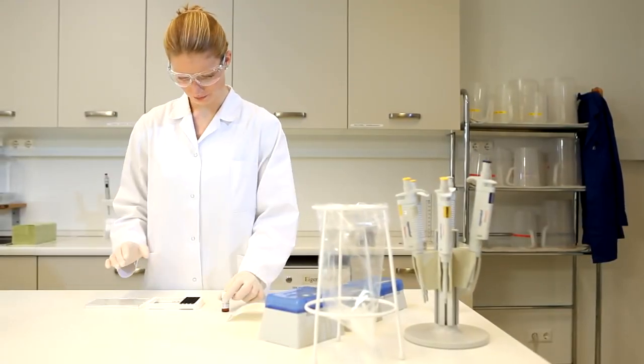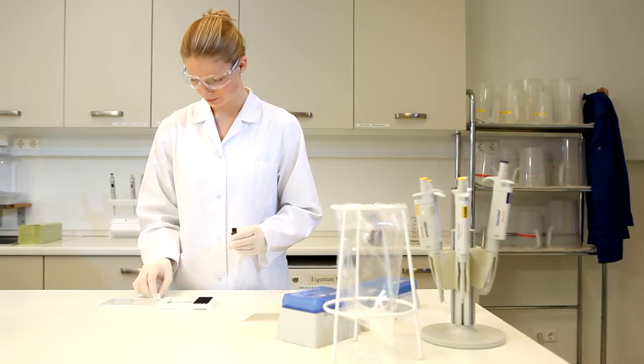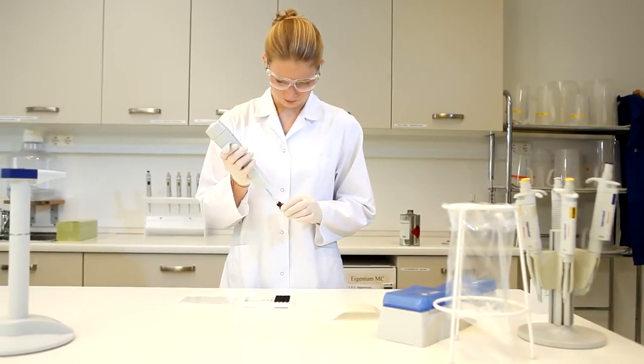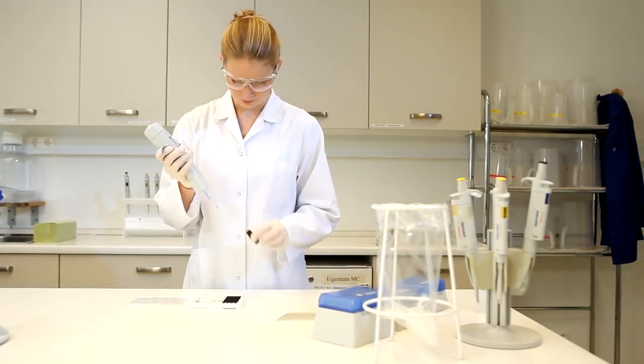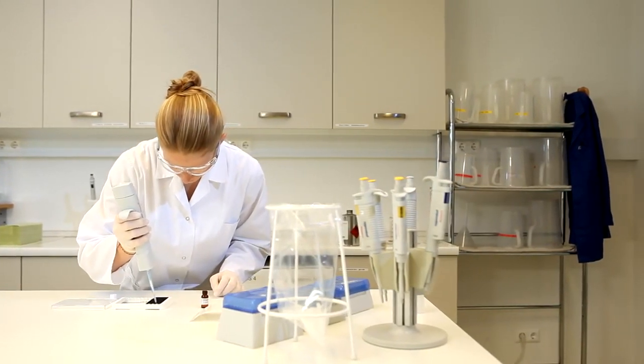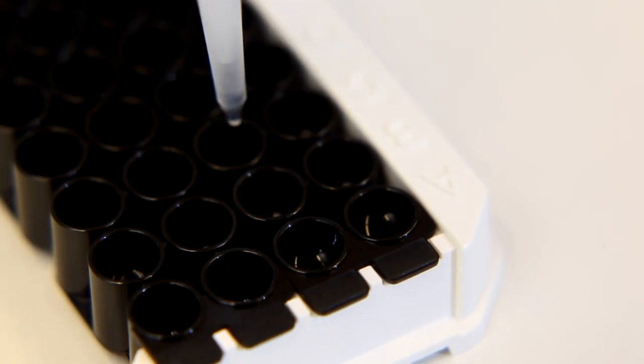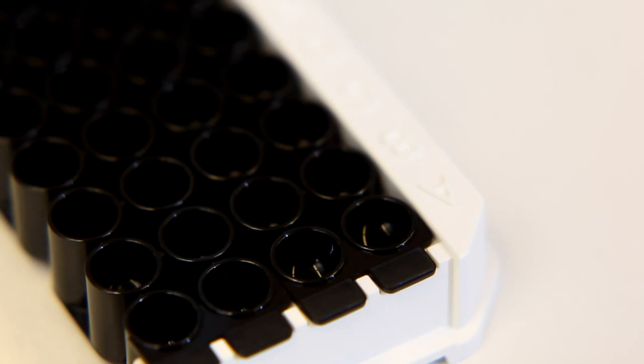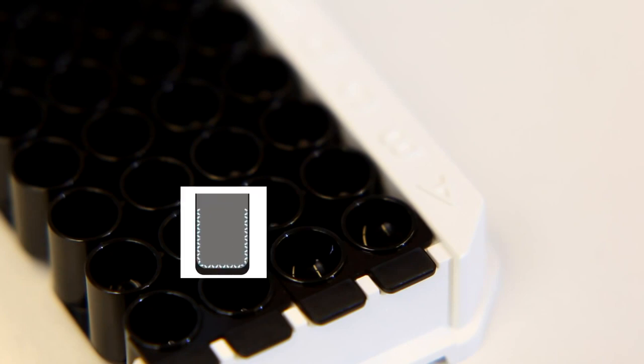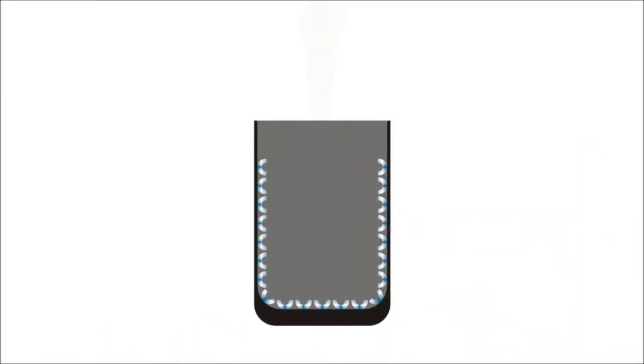Now it's time to start the endotoxin binding in the wells. This process cannot begin until the binding buffer is added. Add 20 microliters of binding buffer to each well. It is important to pipette carefully to avoid cross-contamination. As soon as the binding buffer is added to the wells, the phage protein coating on the well surface is activated. The binding of endotoxin in the sample begins. As with a classical ELISA, the target analyte endotoxin is selectively bound to the surface of the pre-coated wells in the Endolysa plate.